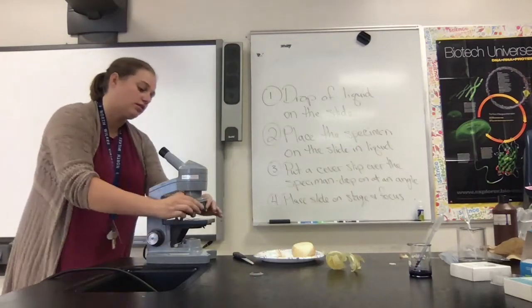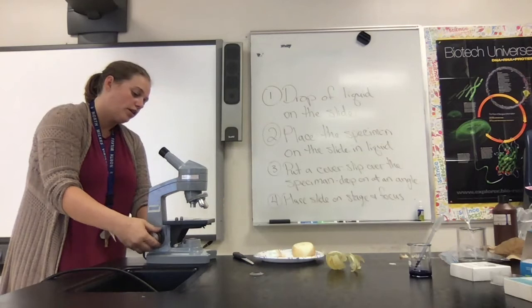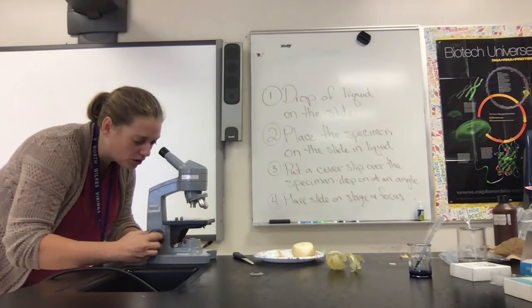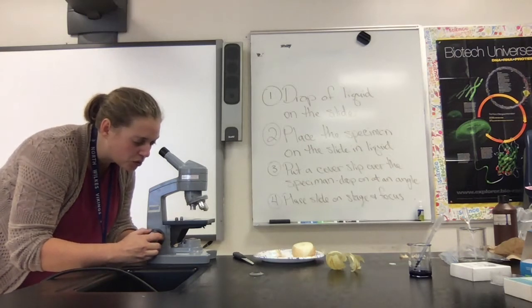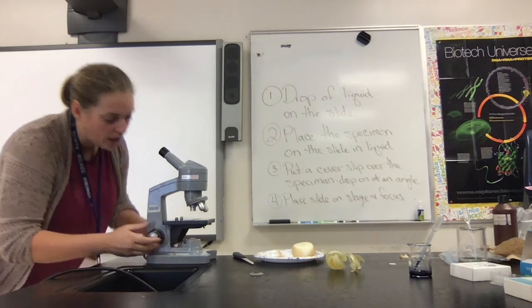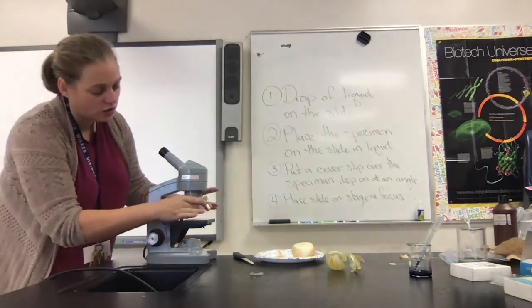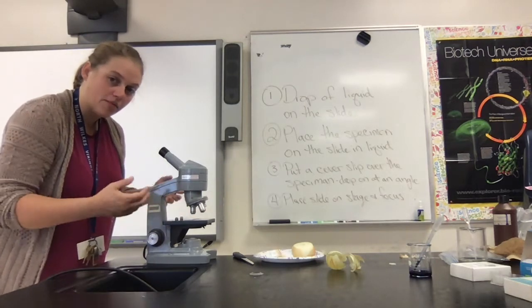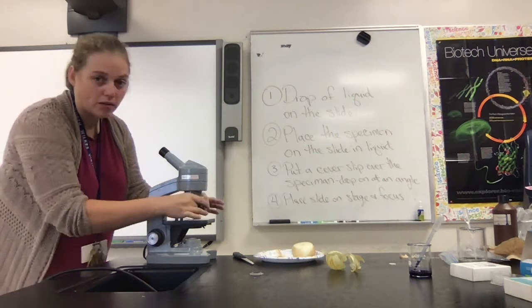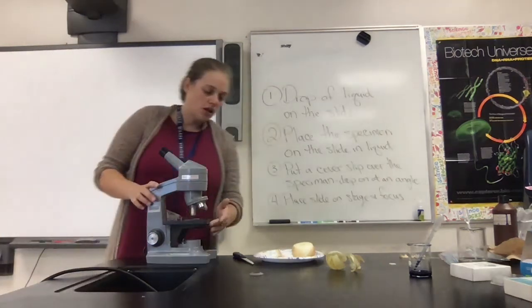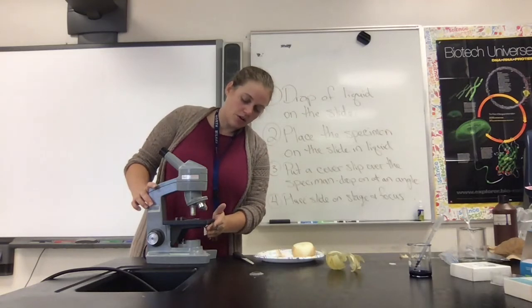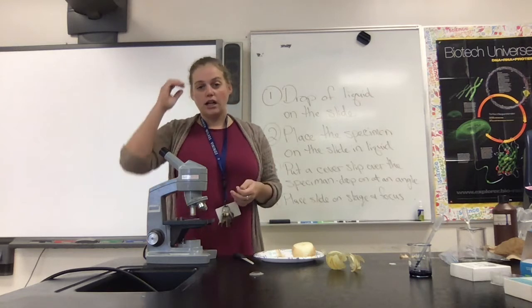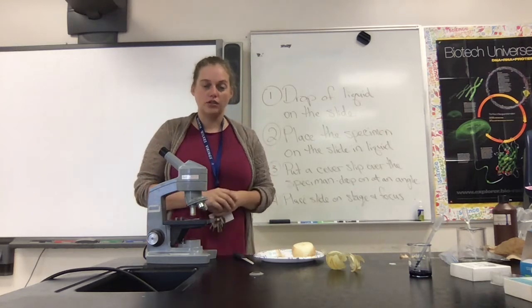Focus by starting on low power with the objective and stage as far apart as possible. As you look through the microscope, lower the objective toward the stage until you see detail. Once you see detail, switch to the next highest power and use the fine focus to get more and more detail all the way up to high power. There's also a little slider on your microscope that controls how much light is going through the slide, which you can use to increase the contrast of what you're looking at.